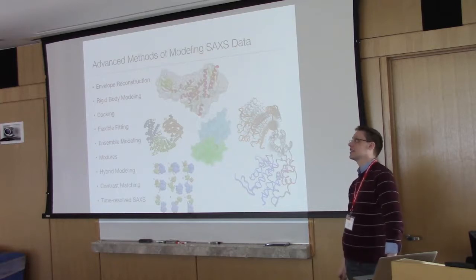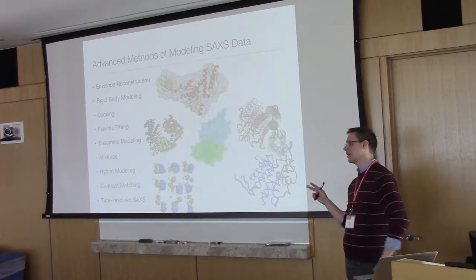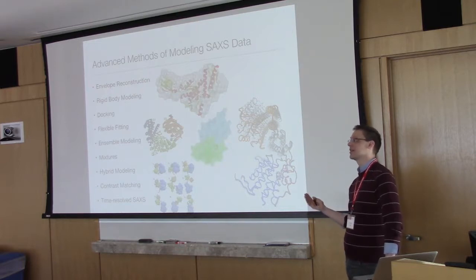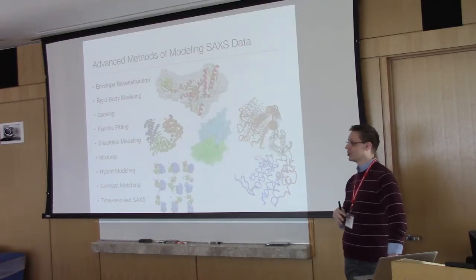Yeah, exactly. It's tough, because remember, if you're reconstructing multiple ensembles, multiple shapes, you're using those same 10 unique pieces of information to now reconstruct 2 or 3 shapes. And so it's that much worse of an observation to parameter ratio. So your resolution and your fidelity in your models gets worse as you try to reconstruct more and more of the ensemble.